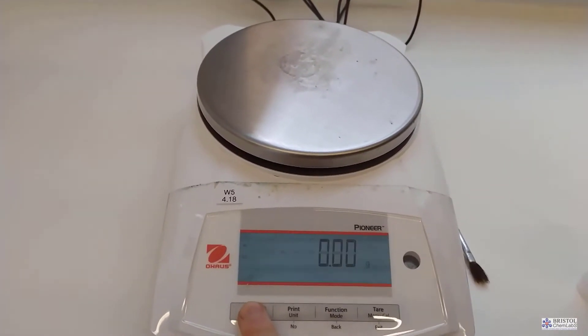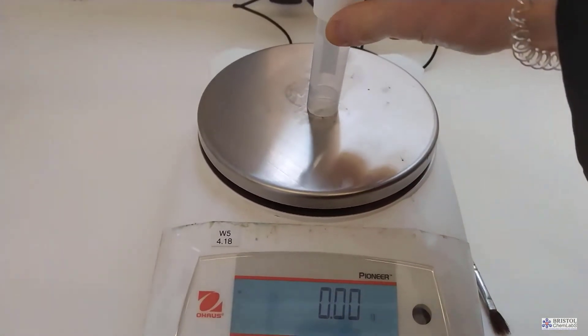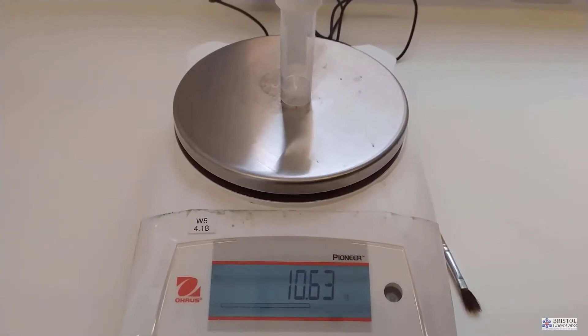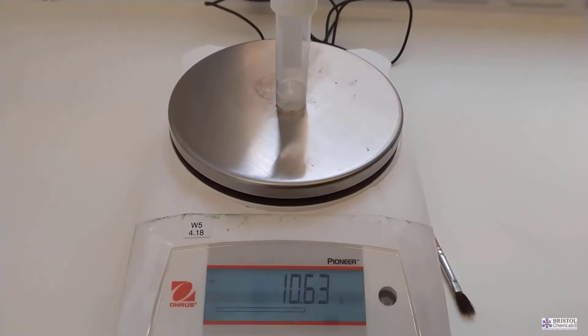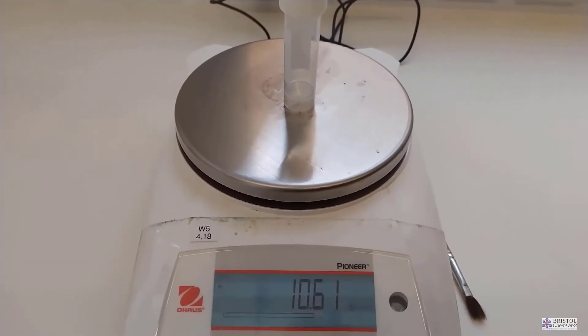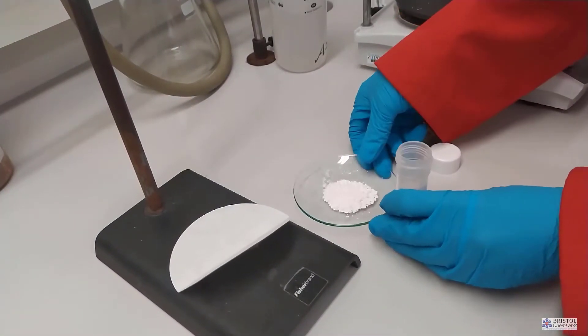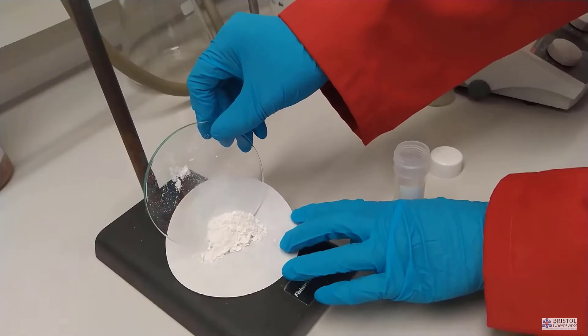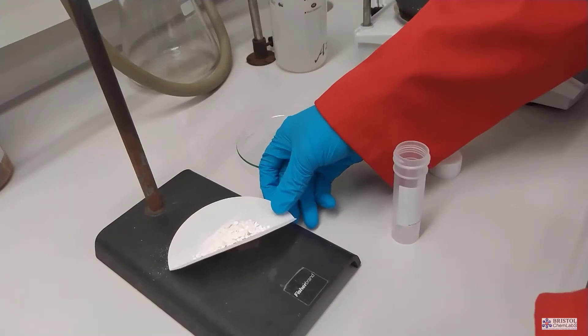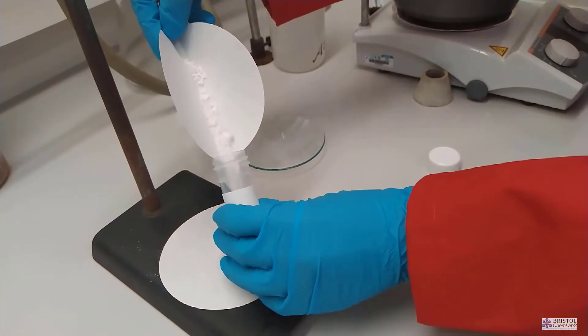The balance should be away from any vibration so a solid bench top is usually fine but of course you've got to watch out for drafts from nearby windows. Drafts affect the way that the balance works and will give you a less accurate measurement. Chemicals should never be weighed directly onto the pan of the balance. They should always be weighed into a container first. A lot of laboratory balances have a taring mechanism that allows you to zero the balance. If you place a container on a balance that is empty you can tare it to zero and add the mass required. That makes calculations unnecessary and removes one point of error.